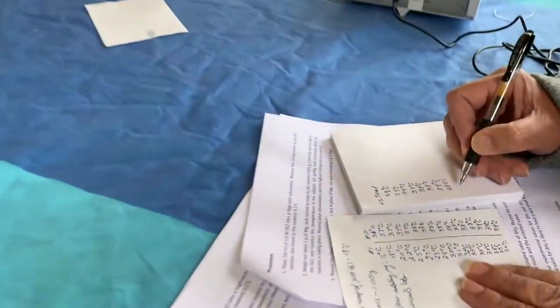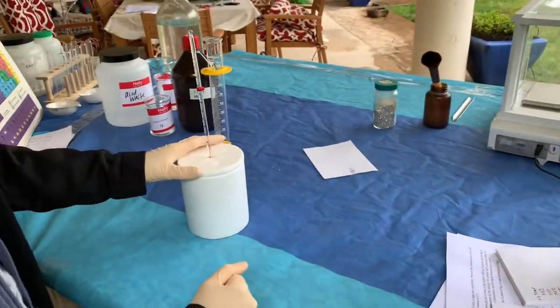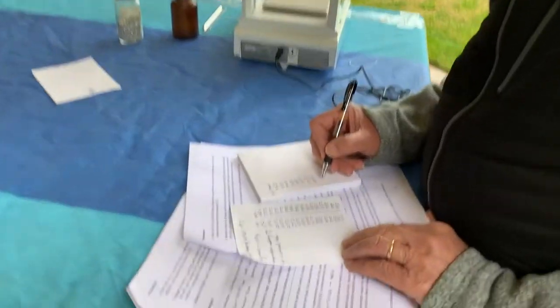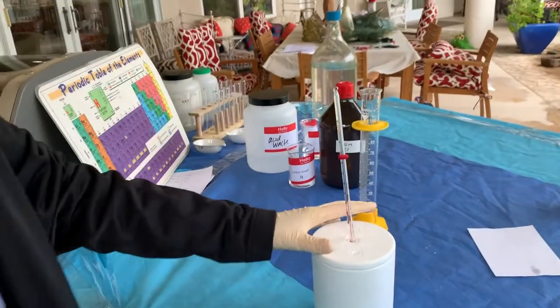So it looks like our maximum temperature was 39 degrees Celsius. We were taking the temperature every 10 seconds. It's now at 38 — this is our final data.